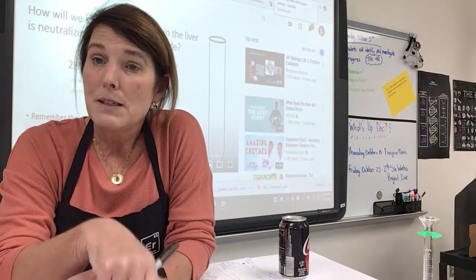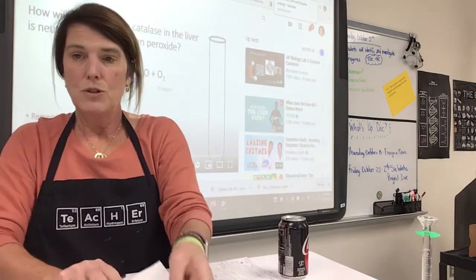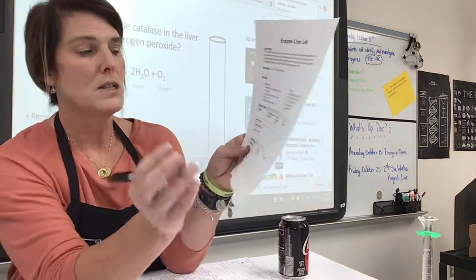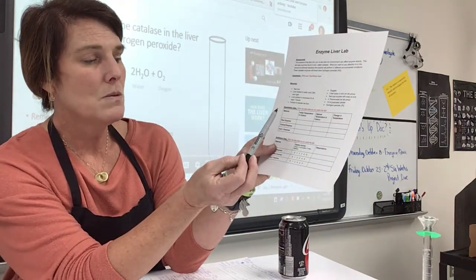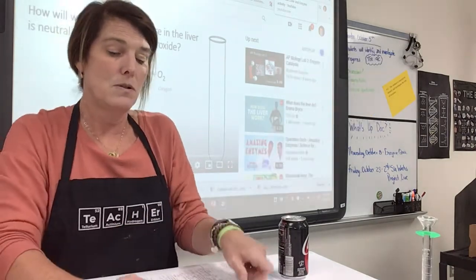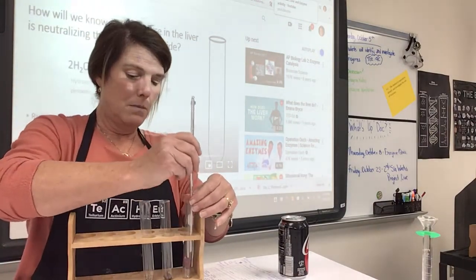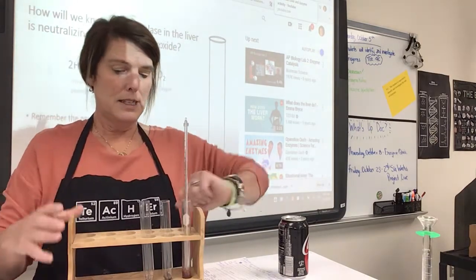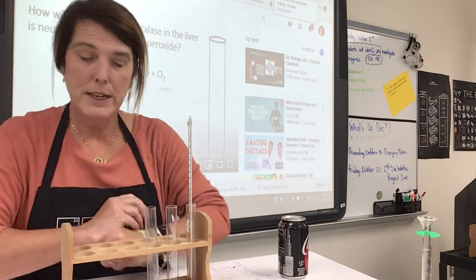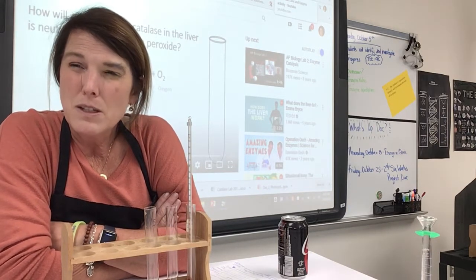But our main purpose, and my main purpose, is to actually show you this lab. So without further ado, to the front of your sheet, your instructions will be, we are going to take the temperature of each material before we even start the lab. So I'm going to stick my thermometer into my raw liver. I'm going to let it sit, and I'm going to time it for probably about 20 seconds.